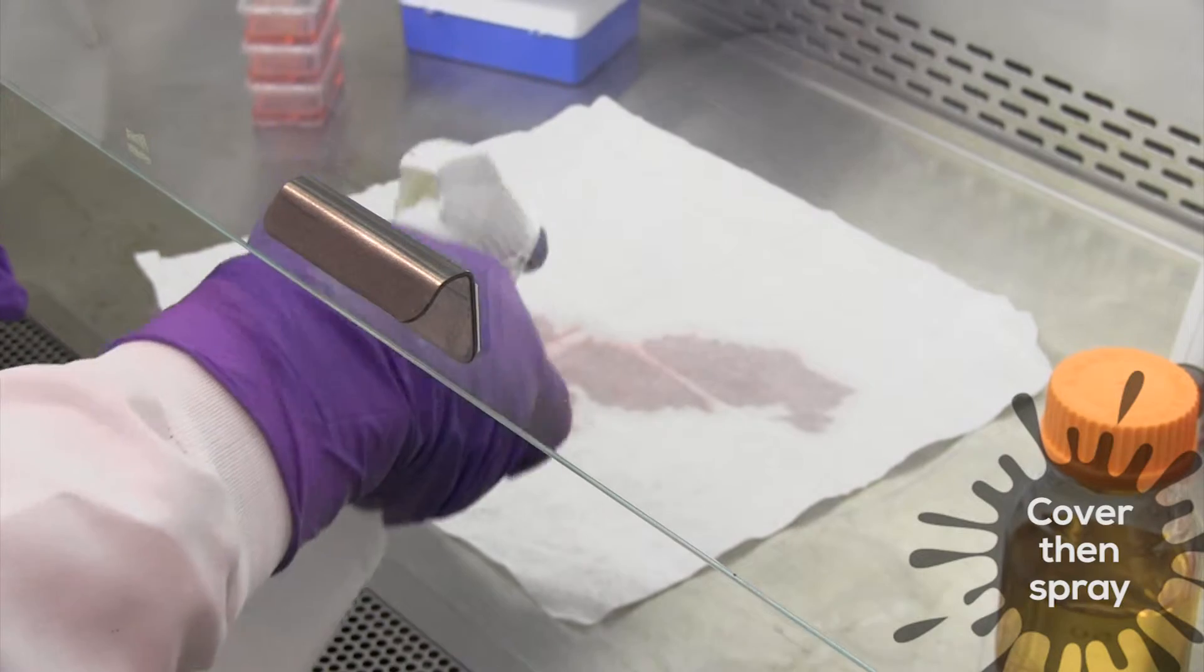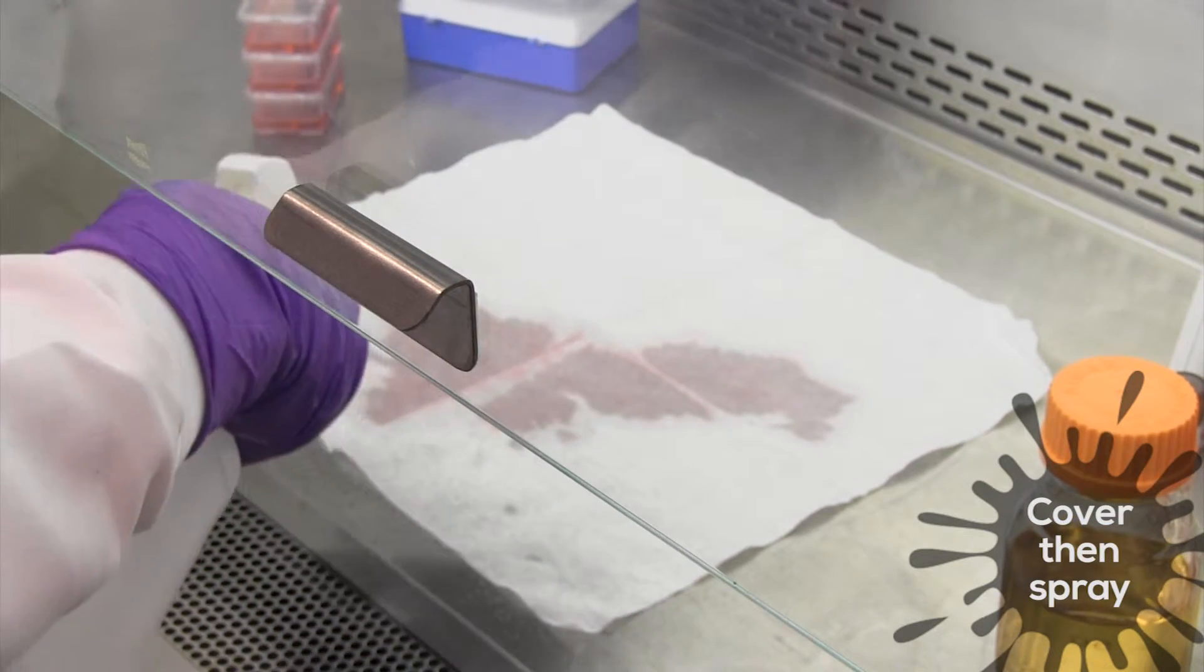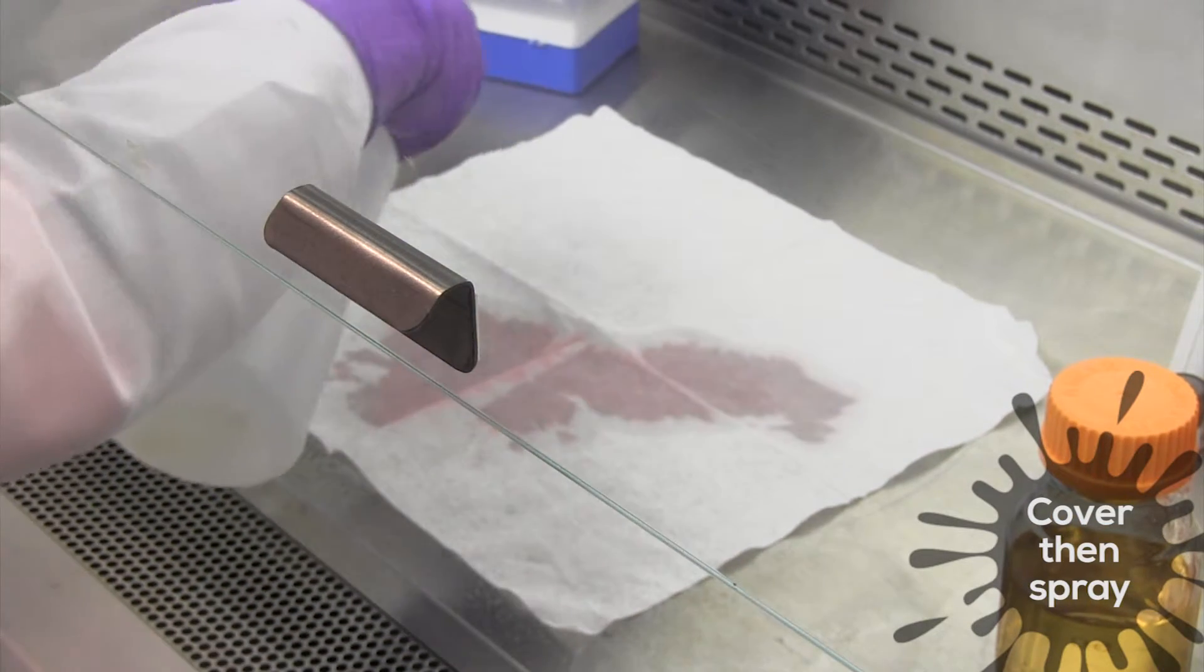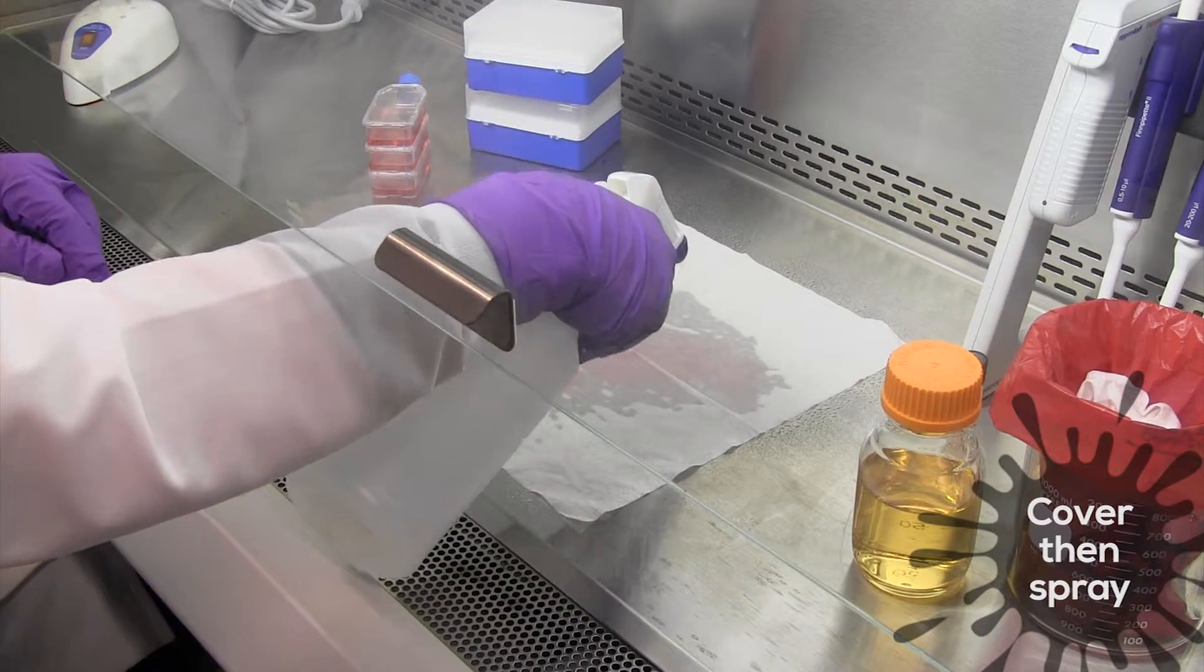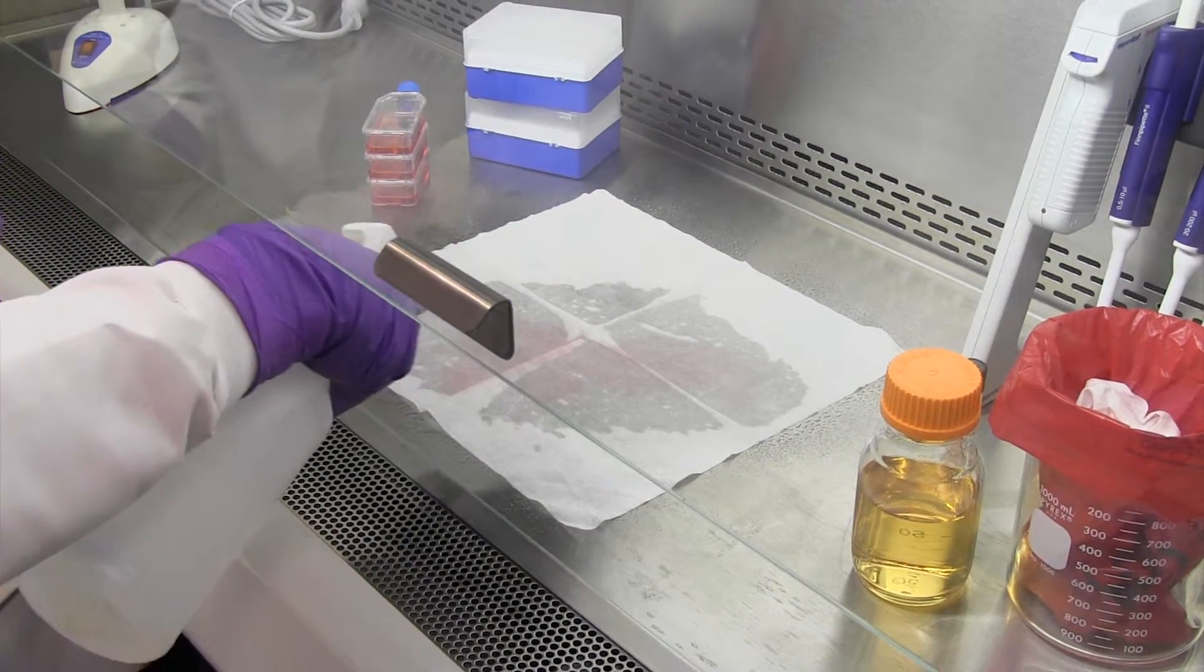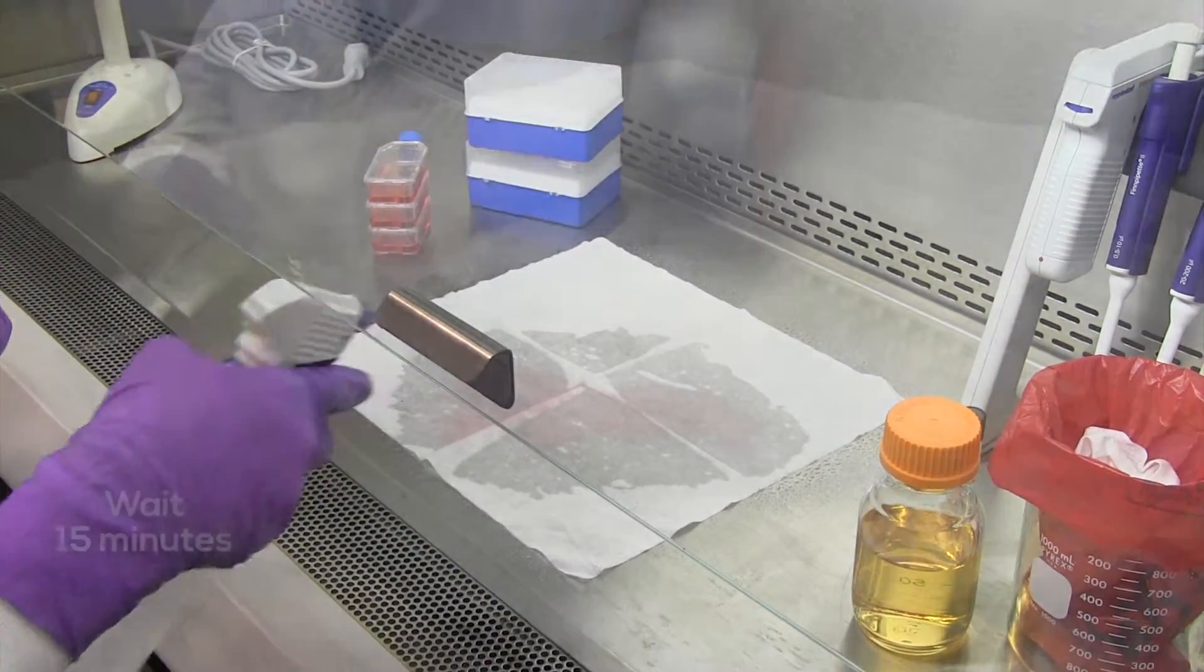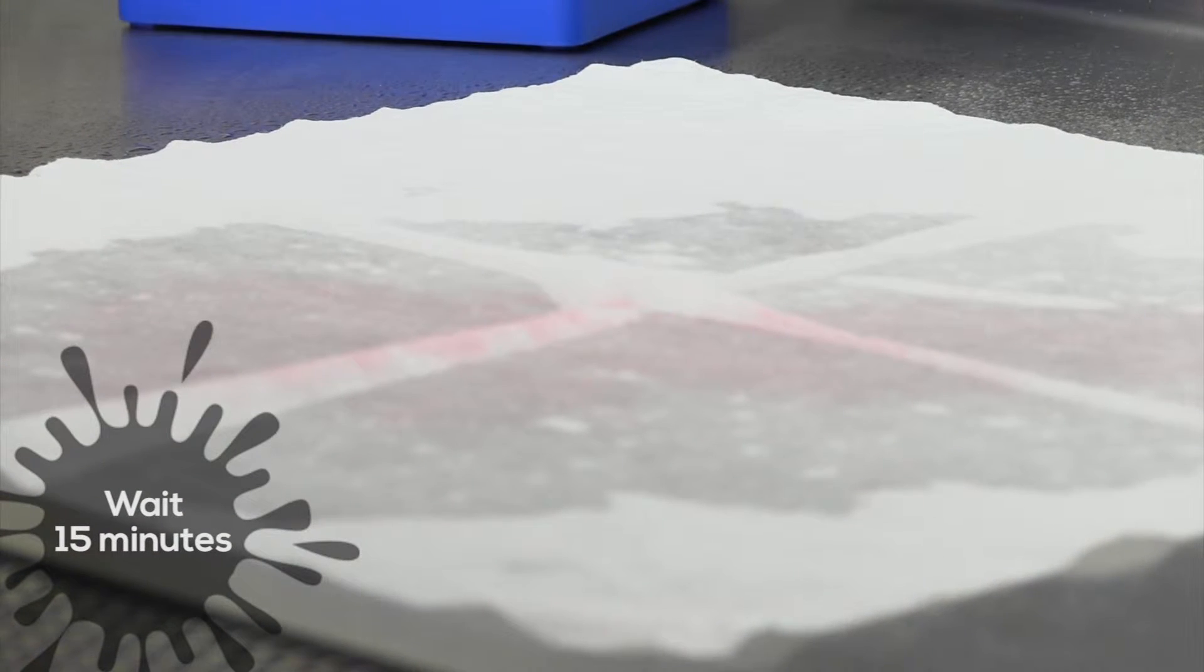Then, spray the absorbent with an appropriate disinfectant like bleach or NBAC2. Next, allow 15 minutes for the disinfectant to work, leaving the cabinet running.